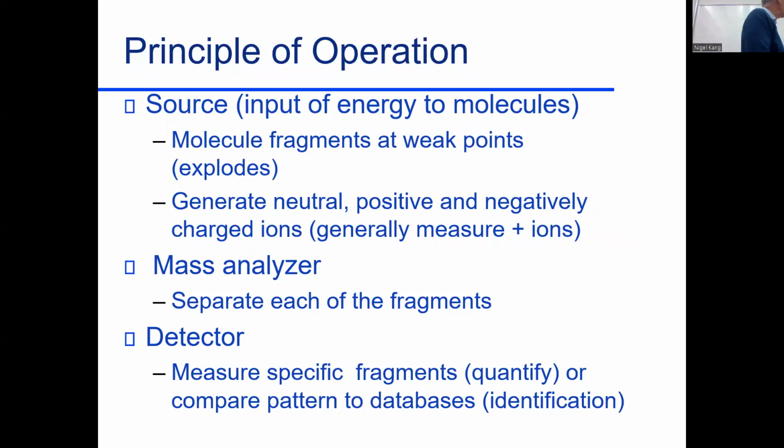So getting into the hardware of the system, these are the three primary parts. First part is the source. The source is where molecules coming into the system are bombarded, most commonly with high energy electrons. The energy is transmitted, blows them into bits, and then you pick the pieces up and try to put the puzzle back together. The machine does that for you. So its first part is, like I say, blowing things up.